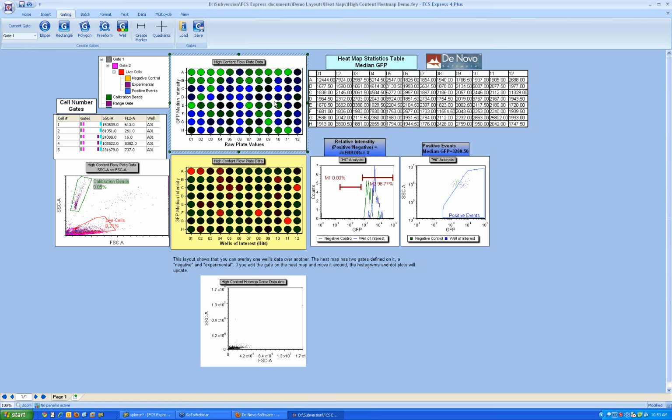You can show that statistic from any parameter. And again, we have a webinar coming up. You can go to that webinar page I showed before, and learn all about heat maps.